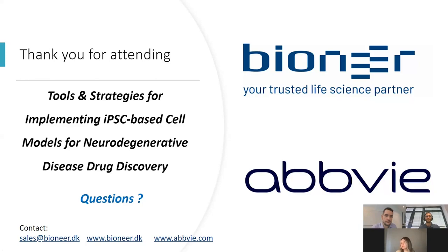This question says, you mentioned that customers typically do not ask for CRISPR off-target analysis, but how do you approach assessing these off-targets? I imagine that this becomes increasingly important once you start introducing multiple edits. Accumulation of off-target edits, perhaps.